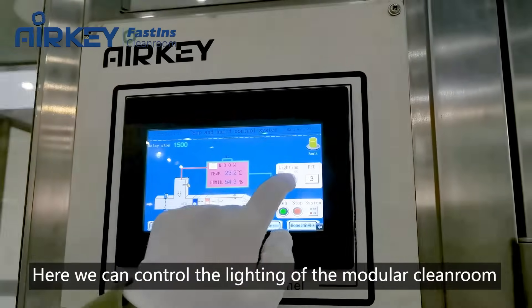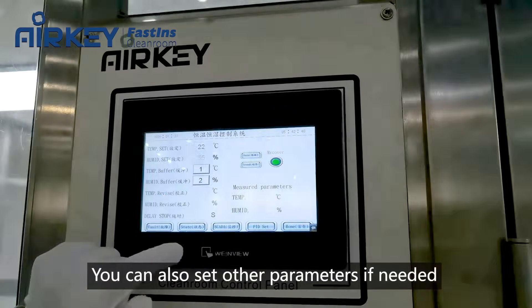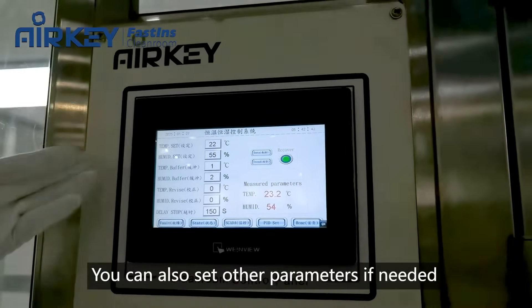Here we can control the lighting of the modular clean room and also the fan filter unit. You can also set other parameters if needed.